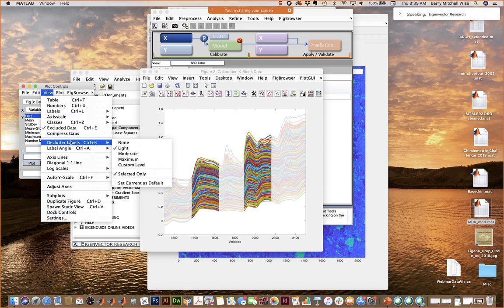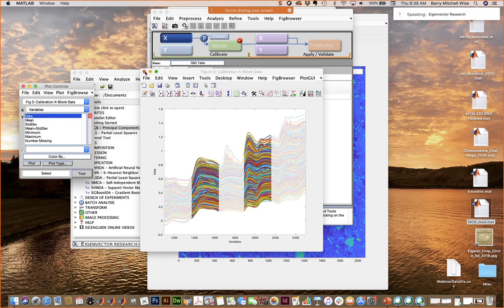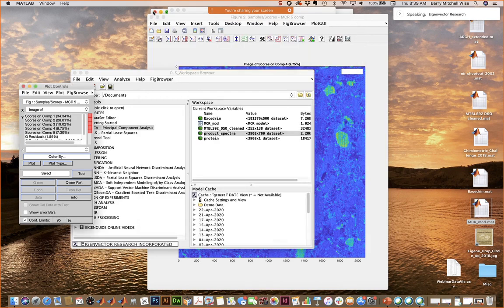There is the search bar, and that's maybe a little tangential, but you can open up a little bar at the bottom of your plot that allows you to search by name. Maybe that could help you.